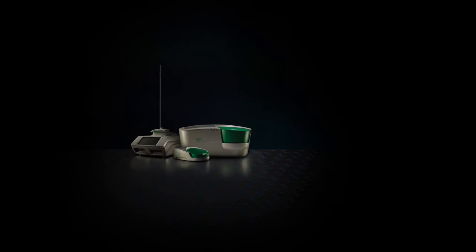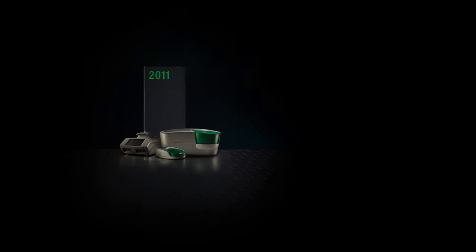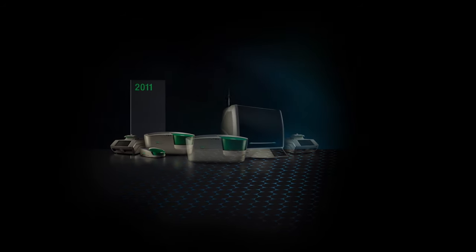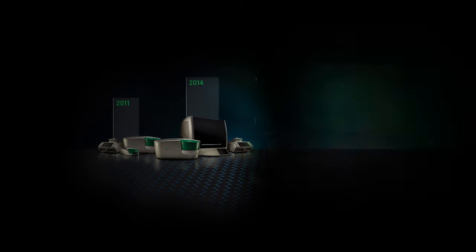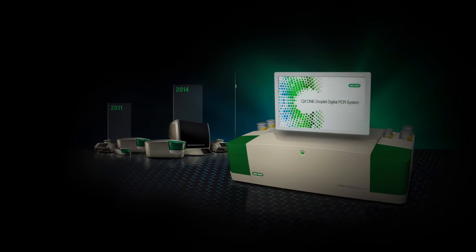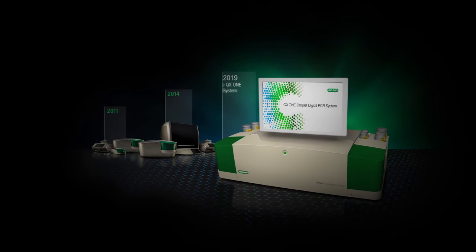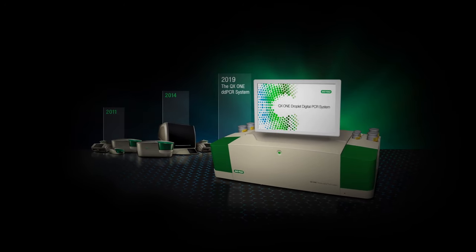The proven unmatched sensitivity you've come to expect from Bio-Rad's family of digital PCR products has a new addition, the QX1.